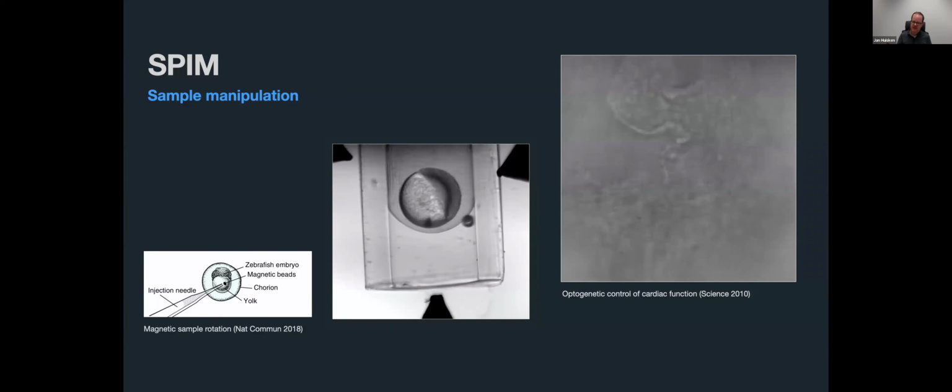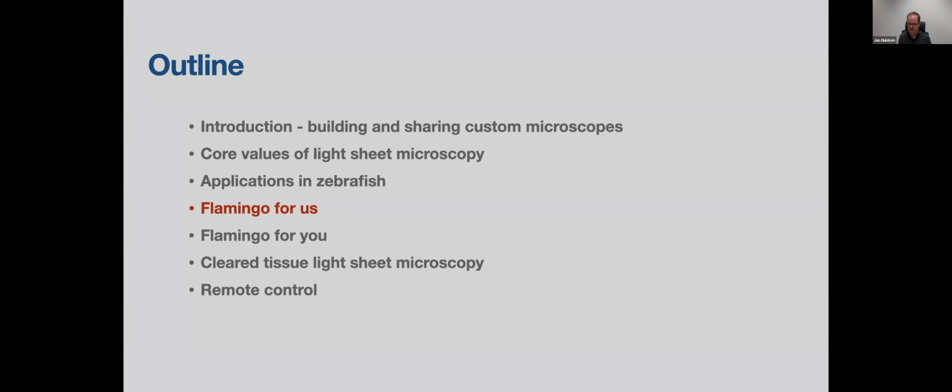So all of these experiments were done on different microscopes. Every video that I've shown you was basically done on a different light sheet microscope.